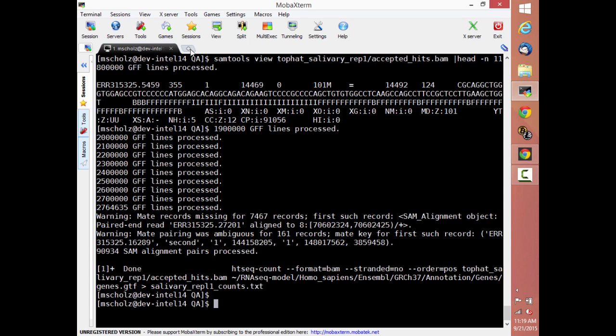So we're going to take all this stuff and go through edgeR and get a list of differentially expressed genes. If we wanted to do the exact same thing and take the counts and put it through DESeq, which is another package, we might get a slightly different set of genes. If I have a slightly different set of genes expressed by two different pipelines, what would you do with those two pieces of information? So combine them is a statement. Do you combine them by taking only the ones that are true in both? Do you take all of both and keep them? Do you keep only the ones you like? What do you do?